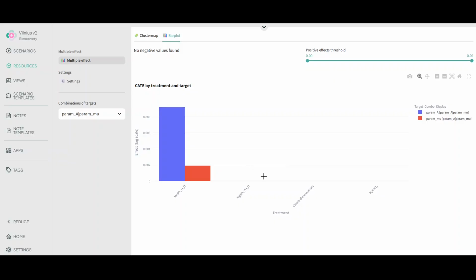So the causal analysis here gives us a complementary and honest answer. Manganese sulfate is causally validated by the data structure, while the contribution of dipotassium phosphate and magnesium sulfate requires a richer experimental design to be causally attributed.